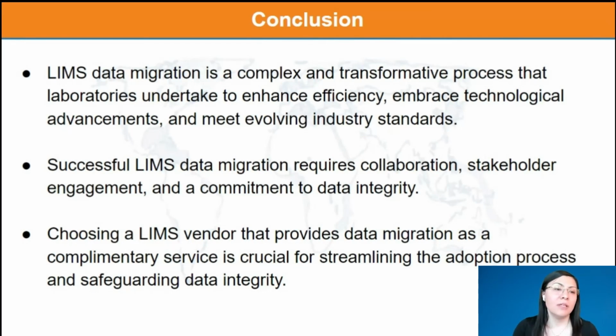And finally, let's go back to LIMS vendor selection, where you have to look for features in the LIMS that will help you to transfer large amounts of data in a simple way. And also, if you have this data migration support as a complementary service, you will improve the operations of your lab and you will reduce the shutdown times. So you will save a lot of money and a lot of time.